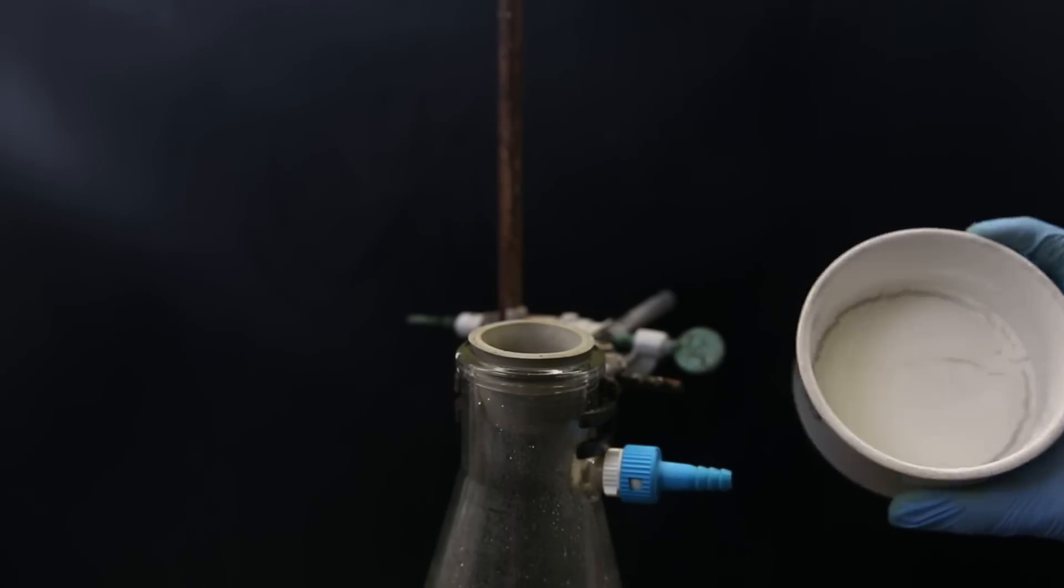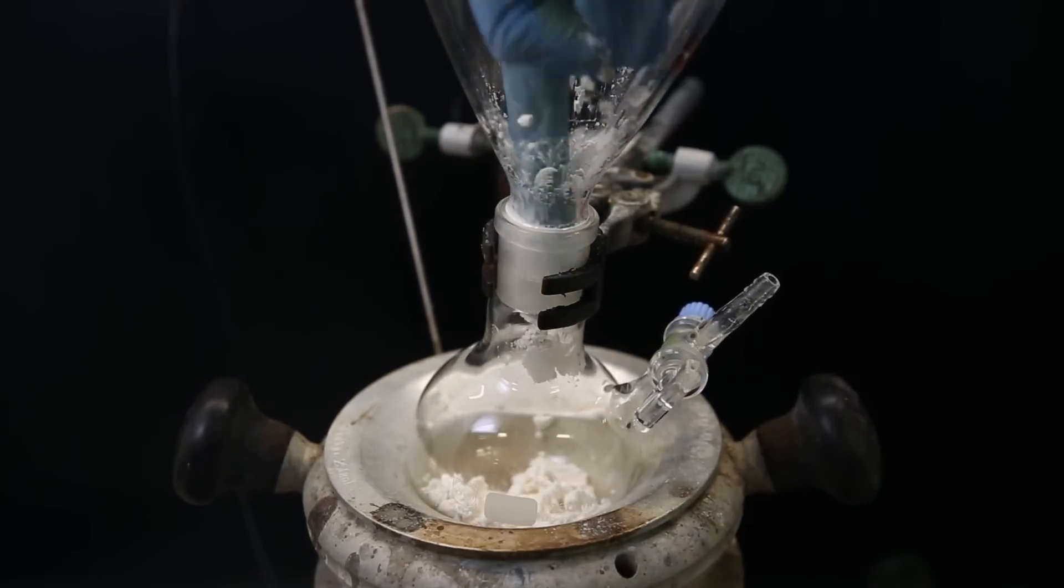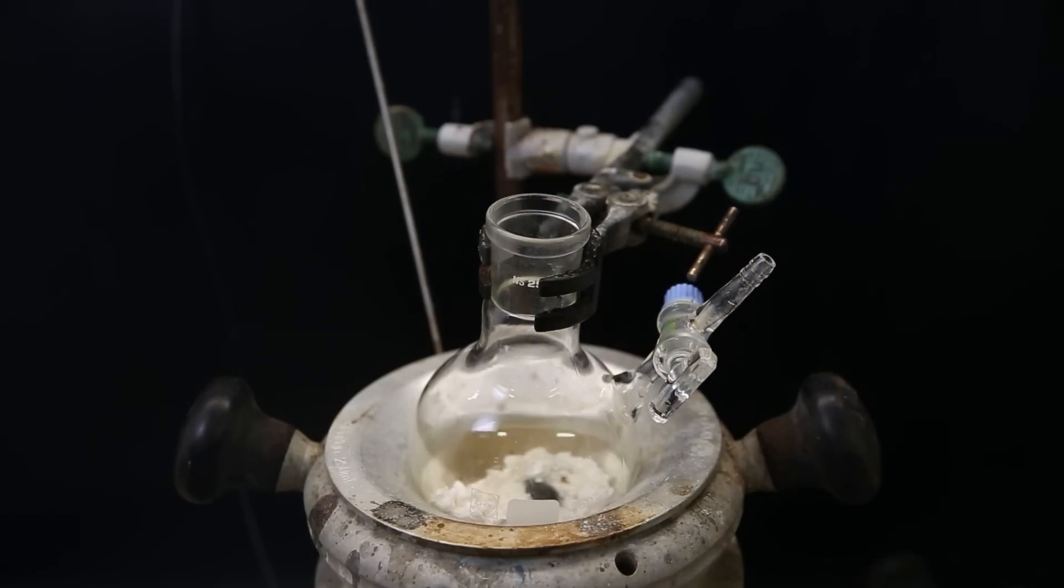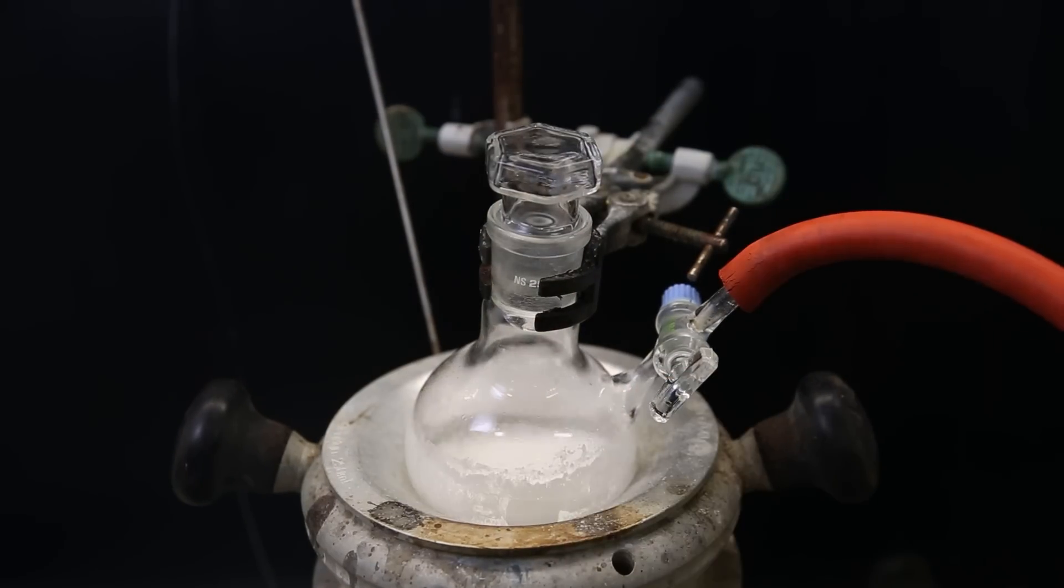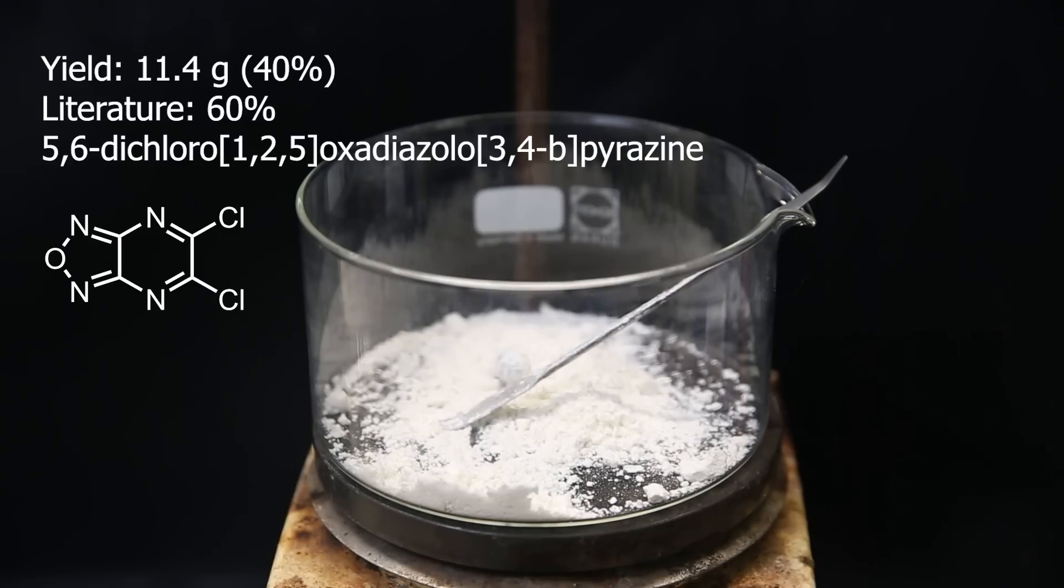I move the wet, pasty product to a flask to dry it again, just like earlier. The last bits I just washed down with acetone, which will get pulled out anyway. When it's dry, I move it all to a dish and the yield turned out to be 11.4 grams, which is 40%, compared to the 60% in literature.